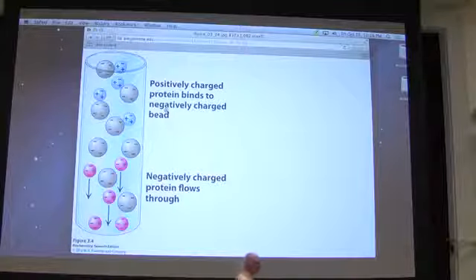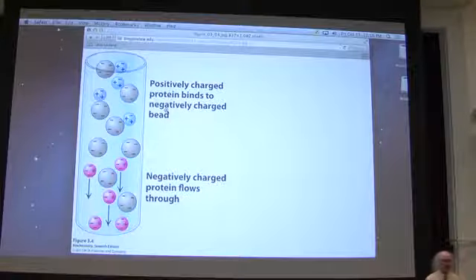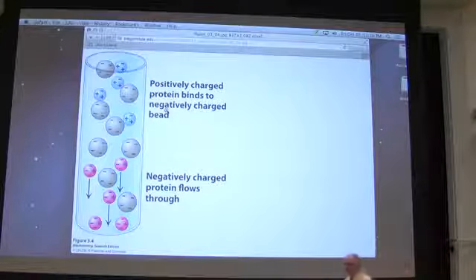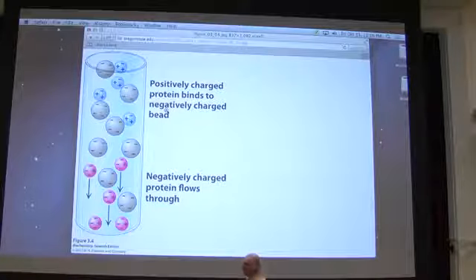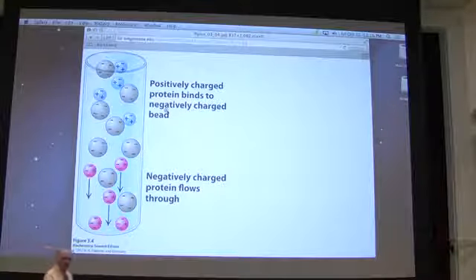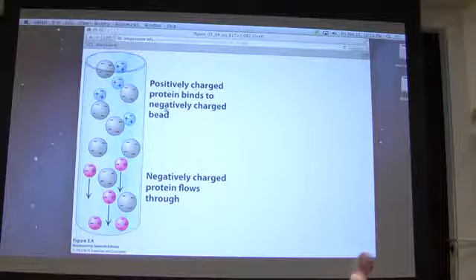If we know what the counter ion is, we know the type of chromatography that we're doing. So if the counter ion is a positively charged molecule, we are doing what's called cation exchange chromatography. This shows cation exchange chromatography. Now you might think, is it possible to have beads with a positive charge and then have a negative counter ion like a chloride? And the answer is yes. If we had that, then we would be doing anion exchange chromatography.